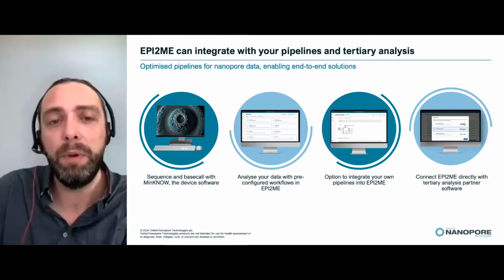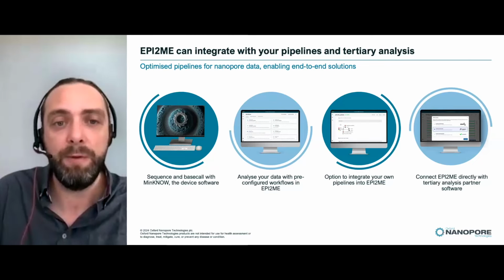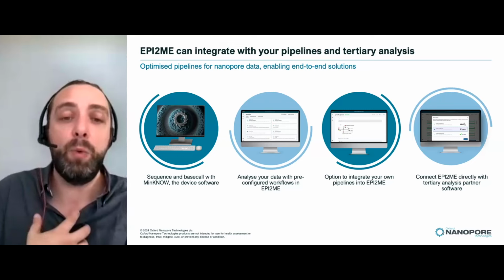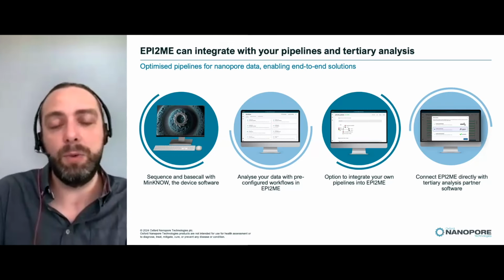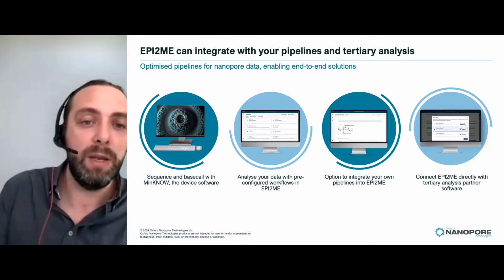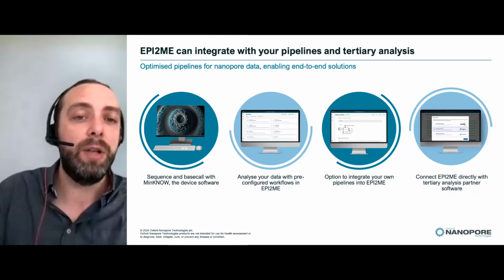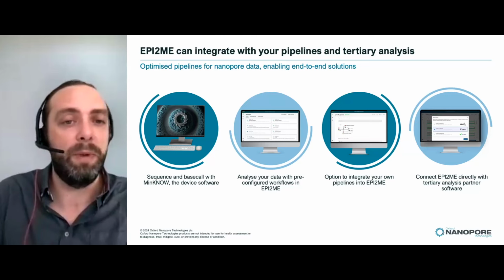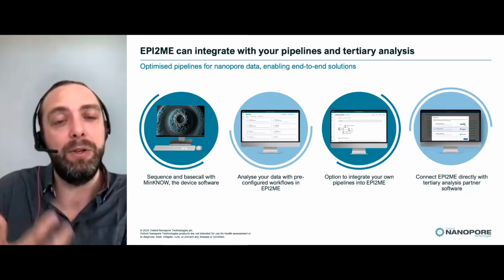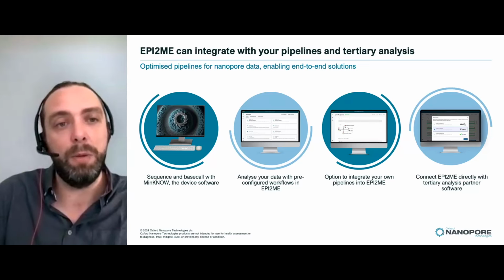As an example, we would be looking to generate the variant call format, or VCF format, which stores variants, and our workflows used for detecting variants will obviously generate this. In the same way, when we generate a de novo assembly, you'll get a FASTA formatted file, or when we generate other types of annotations, they will come in formats that are expected and standard within that application. But again, I'm just going to highlight that in a couple of workflows.